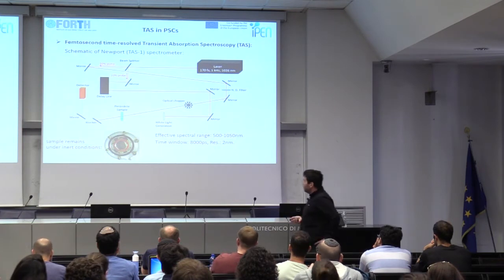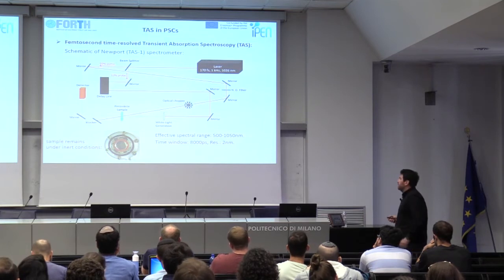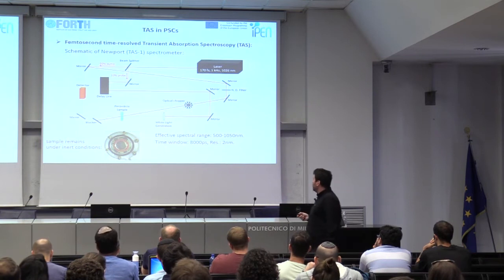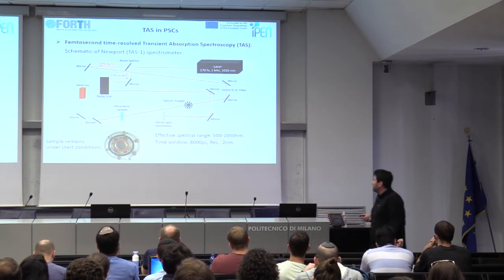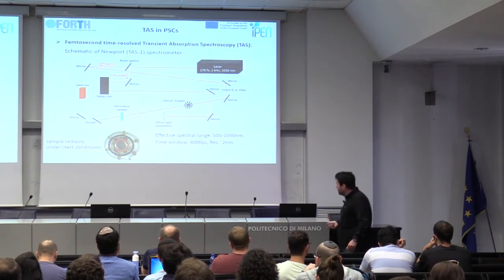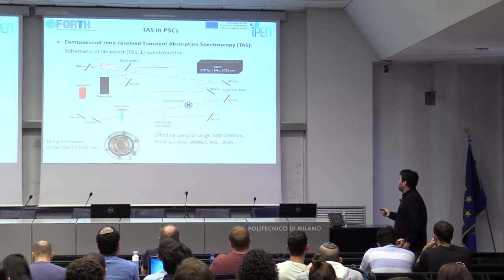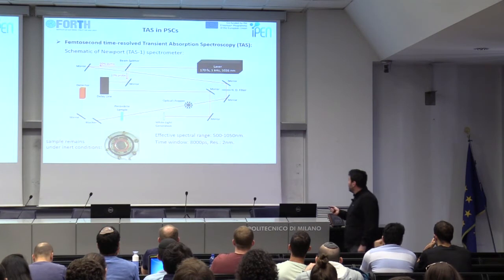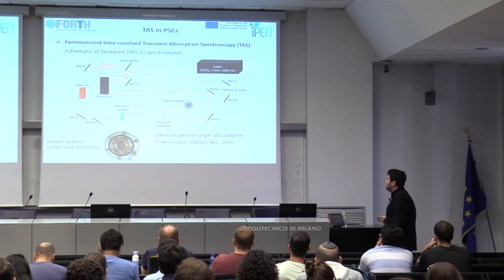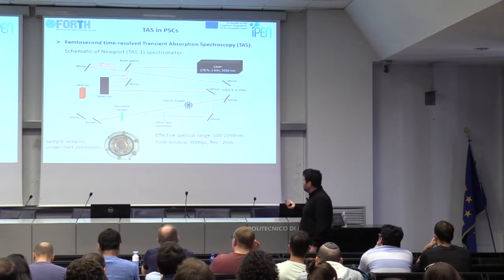So let me show you, first of all, the schematic representation of our experimental setup. We actually employ a Newport TAS1 spectrometer, which is presented here. And as a fundamental laser beam, we use the primary laser of our lab, which emits at 1026 nanometers with a pulse of 170 femtoseconds and a kilohertz rate. So we take the fundamental beam and use a beam splitter to split it.